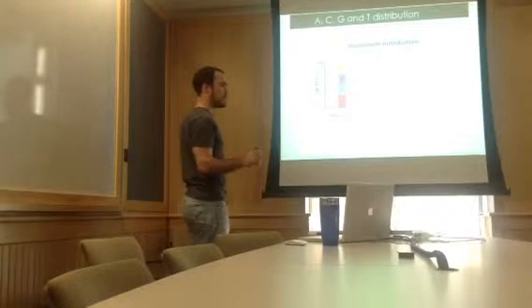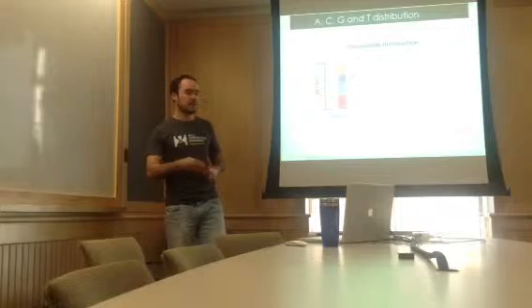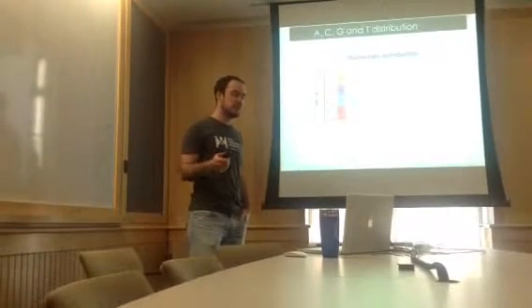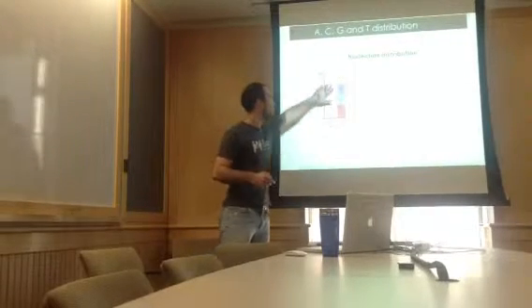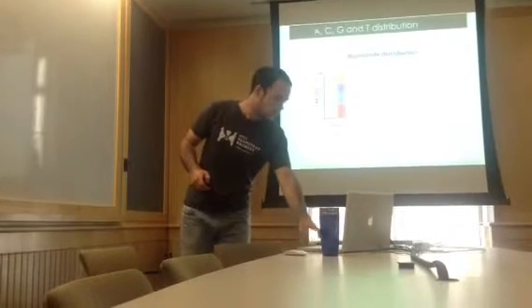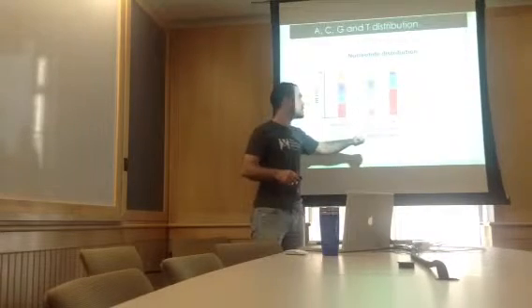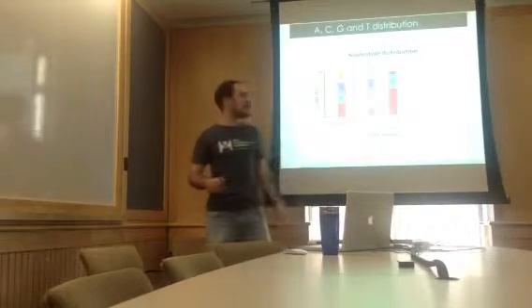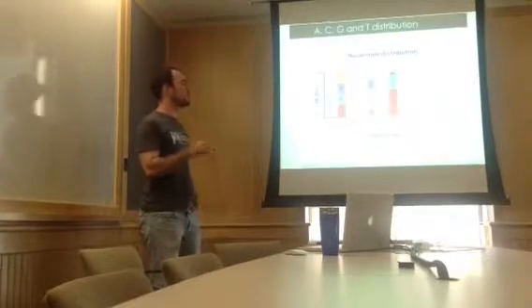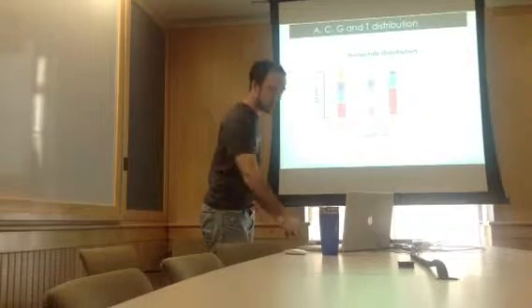One of the first things I was curious to look at was the nucleotide distribution of the reads that we mapped, because they should be enriched in A and C in the DMS treatment, right? So here you have the distribution throughout the transcriptome for each of the 4 bases, and when we look at the DMS data, we can see that for DMS treated samples, more than 86% of the reads that we map correspond to an A or a C, the modified bases.